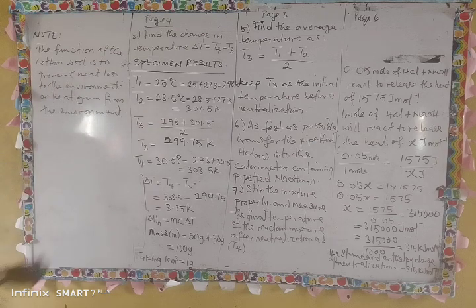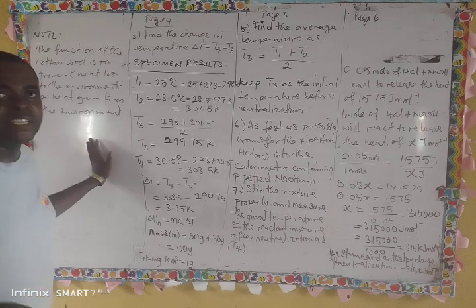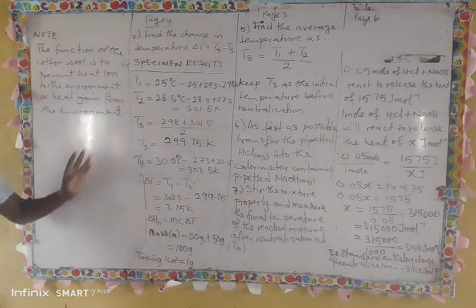That is why, if you have an old refrigerator and the body is already coming apart, between the two panels you will see cork in your cooler. It's to prevent heat loss and heat gain. So your cooler is a mini calorimeter. So we are ending this theoretical class here to take up the practical class.